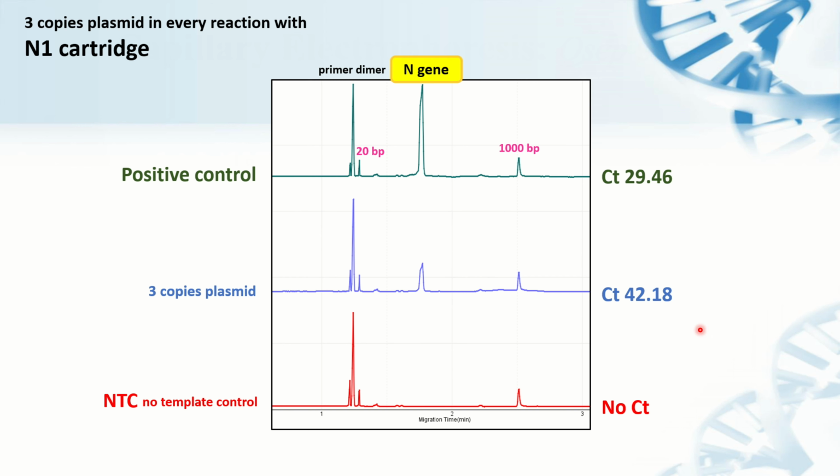You can even use CE as a tool for the second confirmation of qPCR, because sometimes when CT is near the threshold, qPCR needs to be repeated again. But if you have the QSEP series, just directly put the qPCR product on CE, then you can confirm the result.